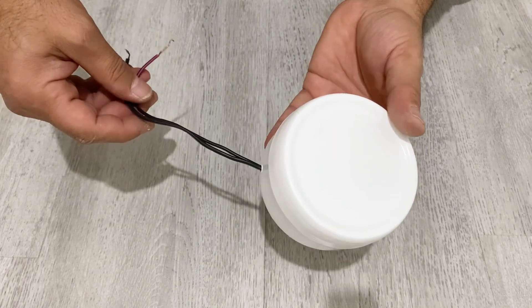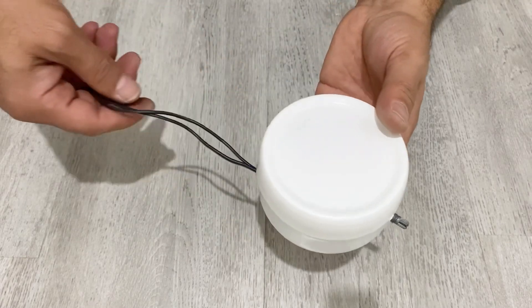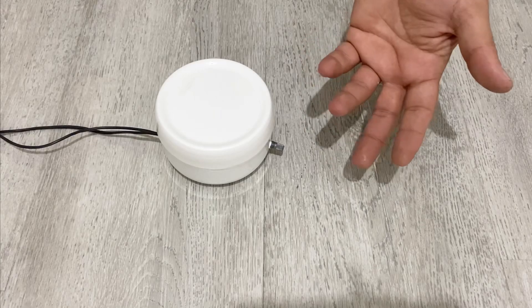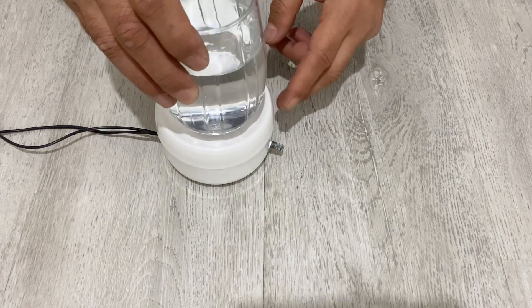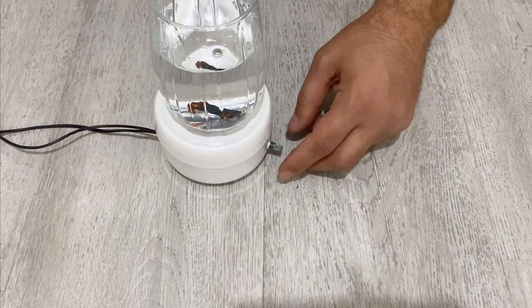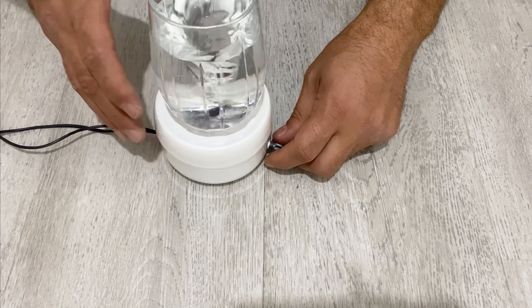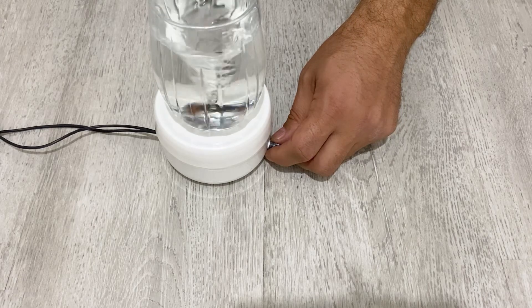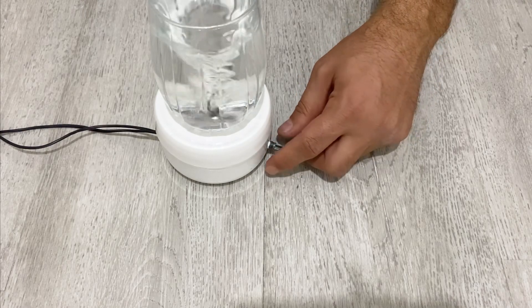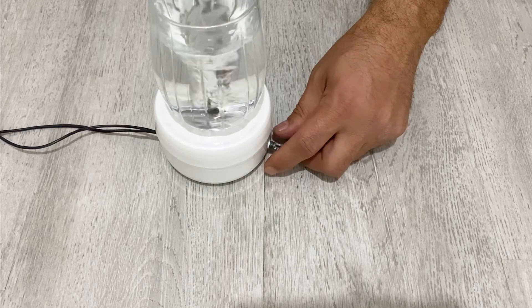Our magnetic stirrer is ready to use! This is the input for the power supply and this is the potentiometer for my voltage regulator. It looks very nice and beautiful. Now let's test it — I have a glass of water here. I'll put the stir bar inside and turn on the stirrer. See how well it stirs the water! You can use the regulator to adjust the speed of the magnetic stirrer.